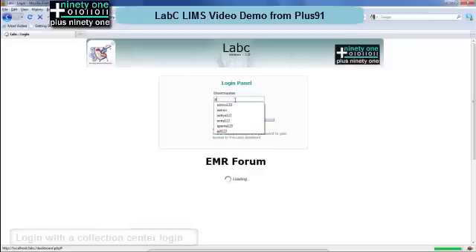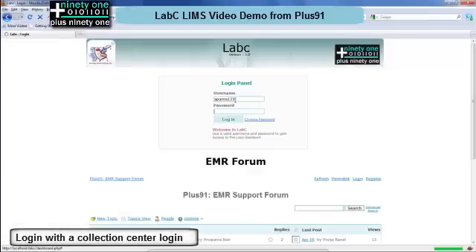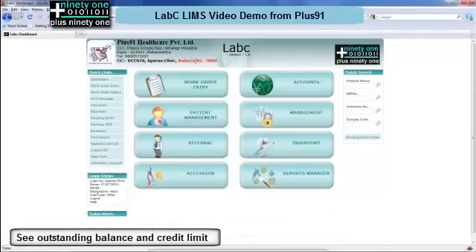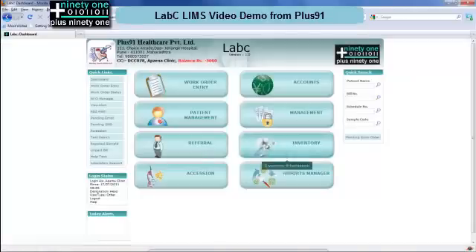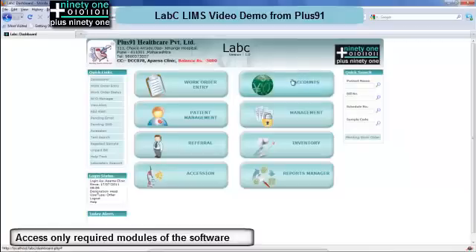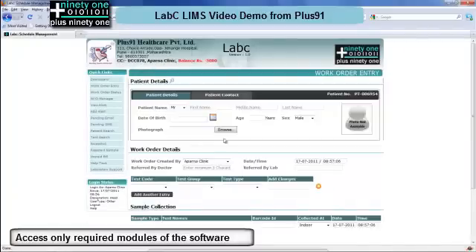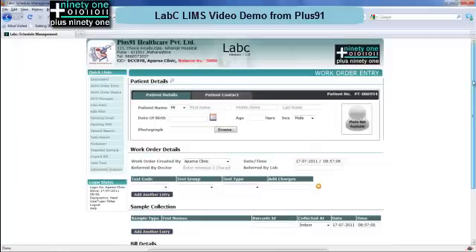Here we can see that they are entering using one of the collection center IDs. Once you enter the username and password and click on login, we see a similar look but on top we can see that we have logged in using Aparna Clinic DCC and what our balance is. A lot of things have been denied to the collection center — they can only enter work orders, only see accounts pertaining to them, and only see samples, reports and status pertaining to them. This is where LabC is used. Thank you.